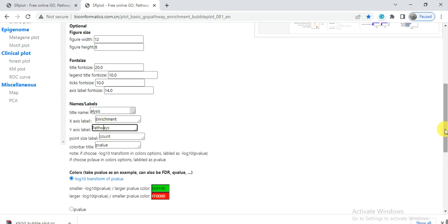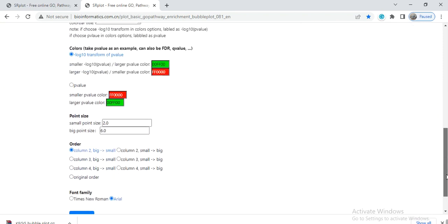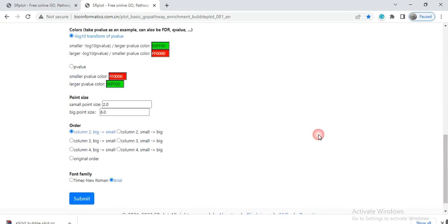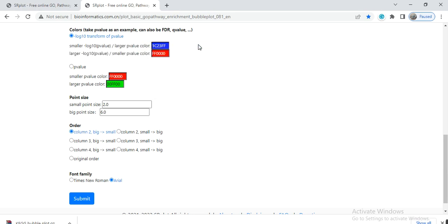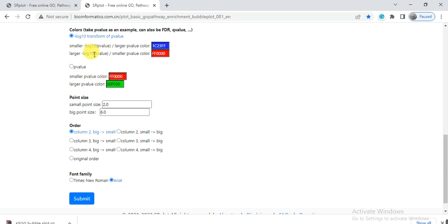From here, the smaller value color will be green - you can change it by clicking on it to green, red, blue, or whatever you want. For the p-value, whether to use p-value or log10, better to use the default. Then there's the point size.